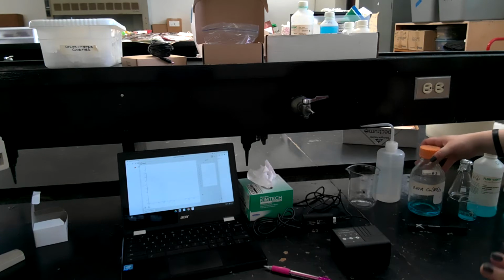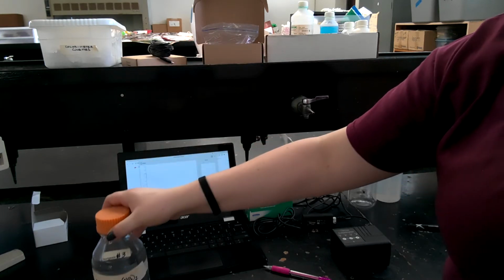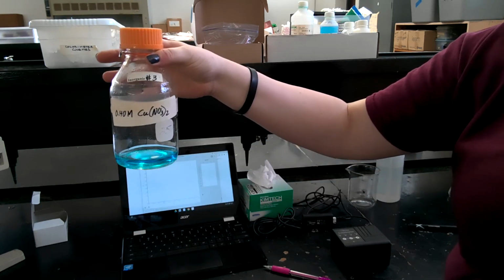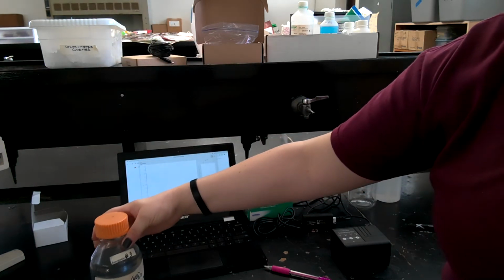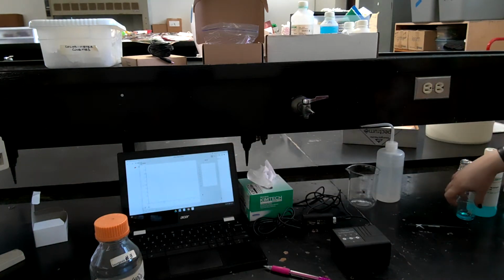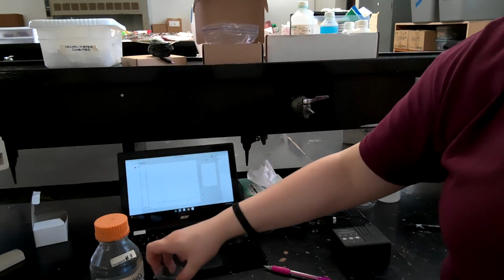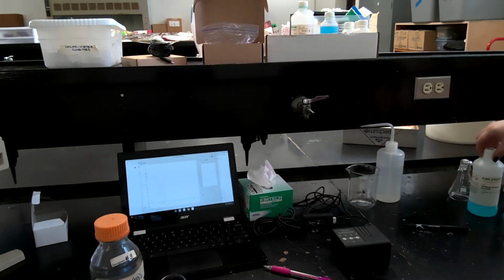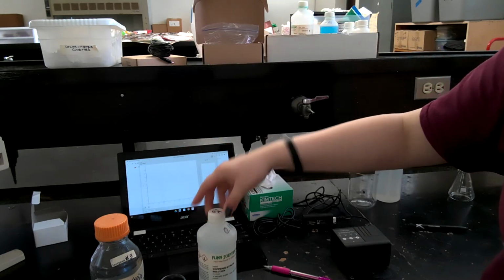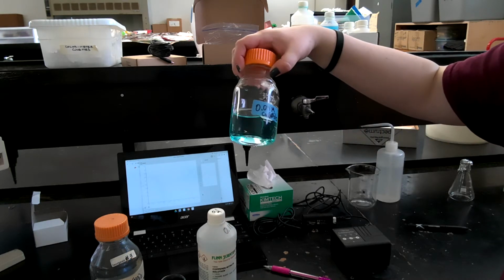So the 5 solutions that we're going to start off with: I want you guys to take note of the color as I hold it up to the video. We have 0.4 molar of copper II nitrate, then 0.2 molar, then 0.1 molar, and then 0.05 molar.